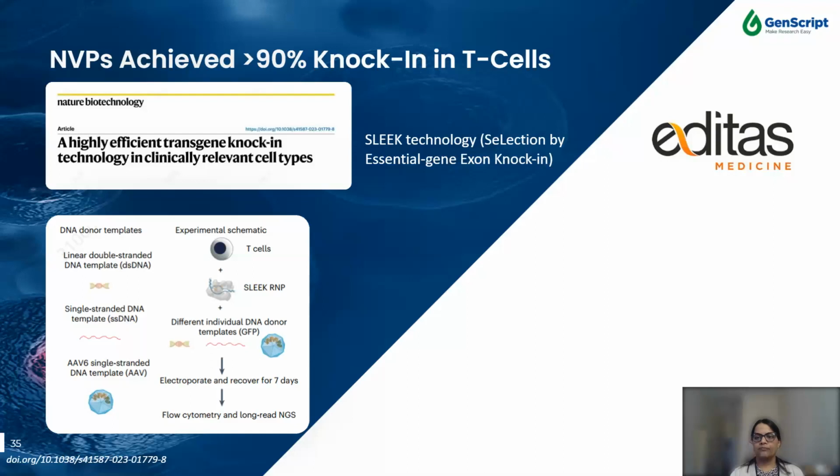For the figure here, they show how they did testing of non-viral DNA template with SLEEK, and for that they optimized the cell protocol for linear dsDNA and ssDNA template.